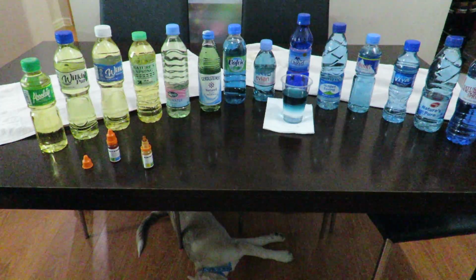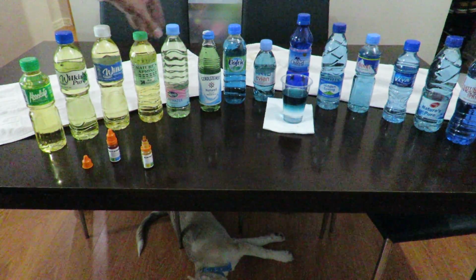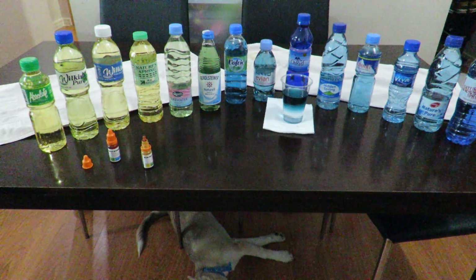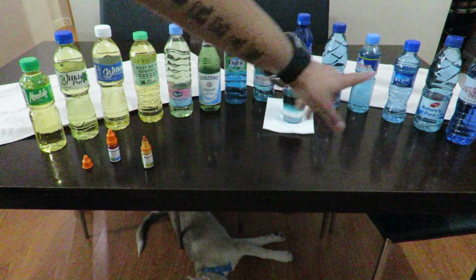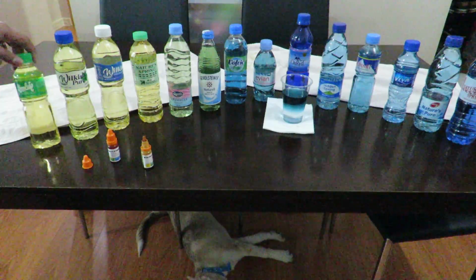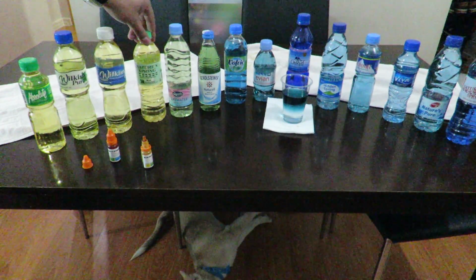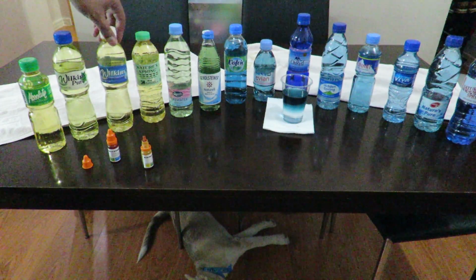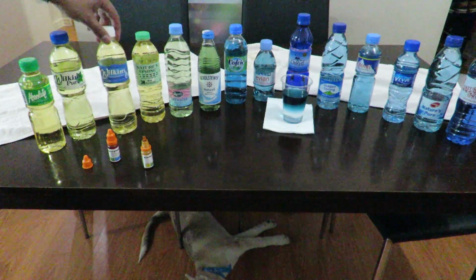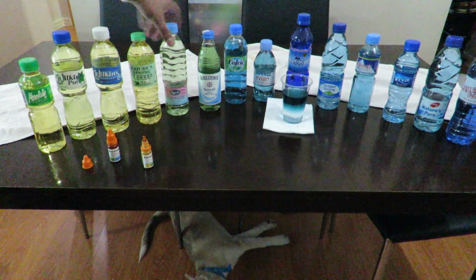So there you have it. The typical water that you can buy in any grocery store here in the Philippines. And what we learned today is that mineral water, which is mostly over here, is better for you than drinking distilled or purified water. Because distilled water, this is purified and this is distilled, always tends to have a lower pH, and that's not very good for you to drink.